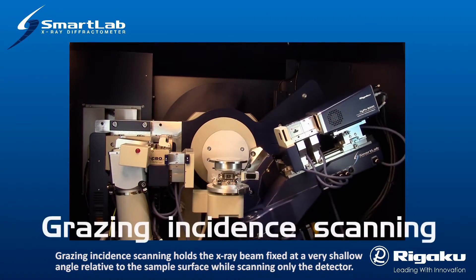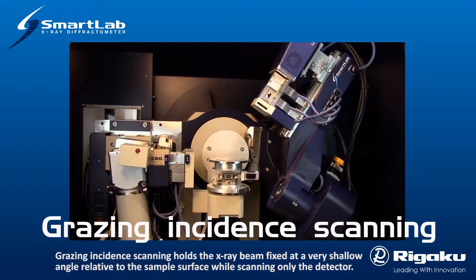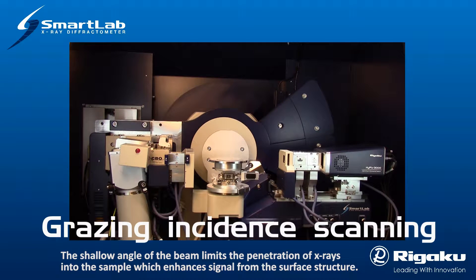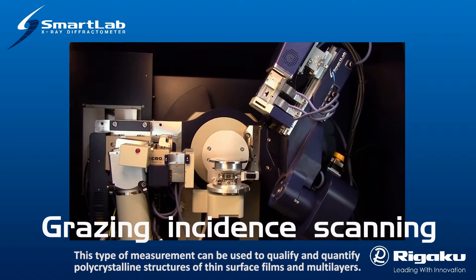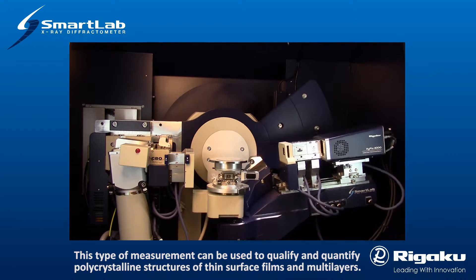Grazing incident scanning holds the X-ray beam fixed at a very shallow angle relative to the sample surface while scanning only the detector. The shallow angle of the beam limits the penetration of X-rays into the sample, which enhances the signal from the surface structure. This type of measurement can be used to qualify and quantify polycrystalline structures of thin surface films and multilayers.